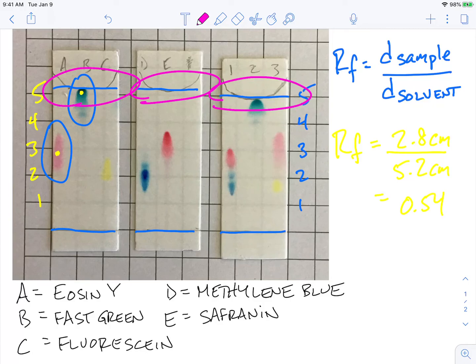So you almost could kind of go across and say, oh, do we have something in one of our unknowns? And I would definitely probably make a good guess without doing the math here that in sample unknown number three, that we probably had Eosin Y sample or known A.